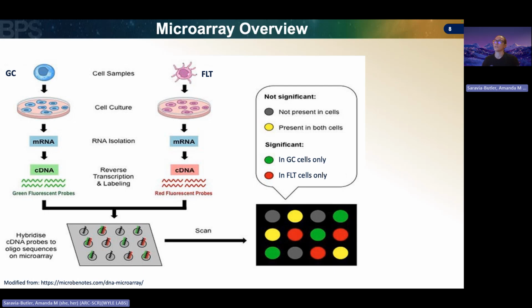So just a quick overview of microarray. There are quite a bit of microarray data sets hosted on the Open Science Data Repository. And just to show you a quick summary of how this technique works, you will start with your treatment. So your samples of interest undergoing a specific treatment. So in our case, our ground control samples and our flight samples.